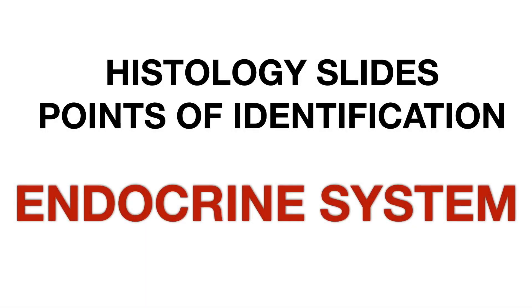Welcome friends. The topic of today's discussion is histology slides on identification of the endocrine system.